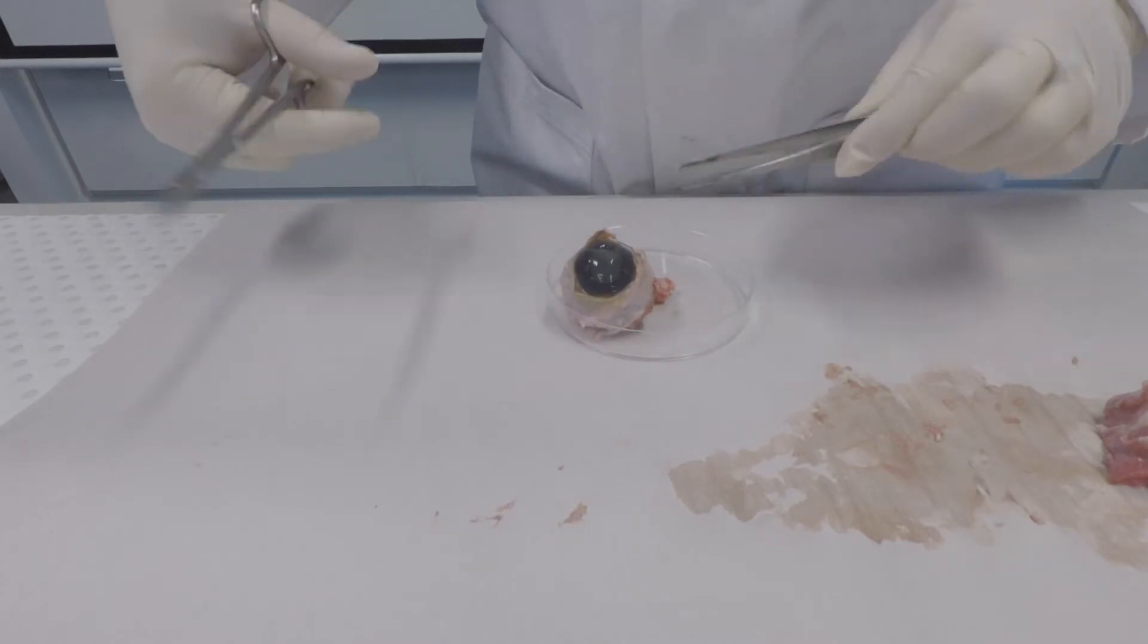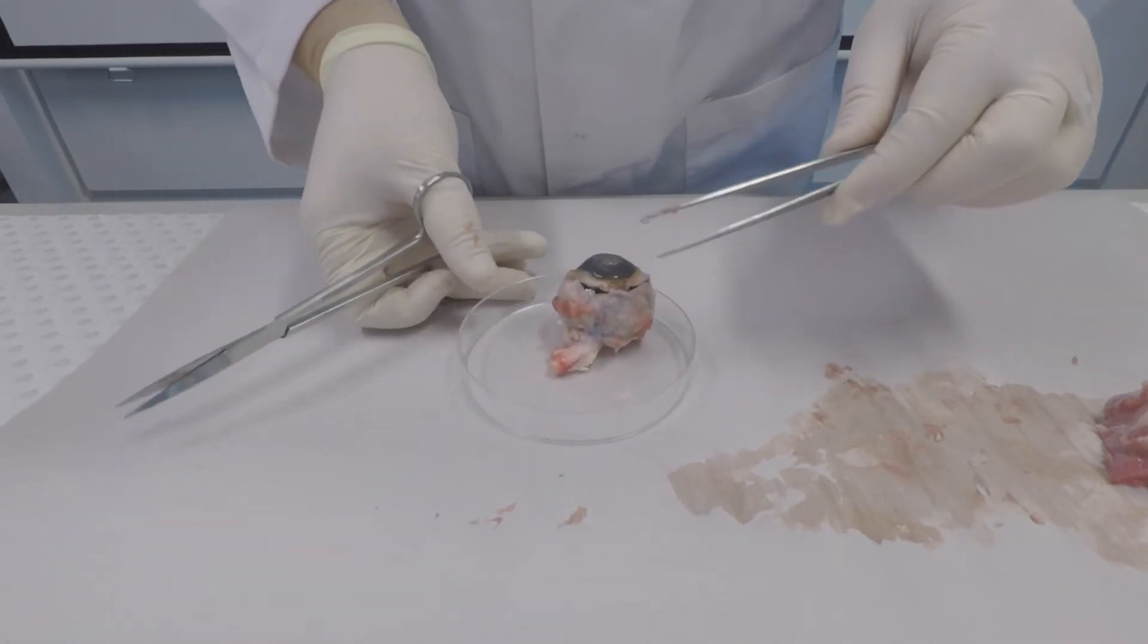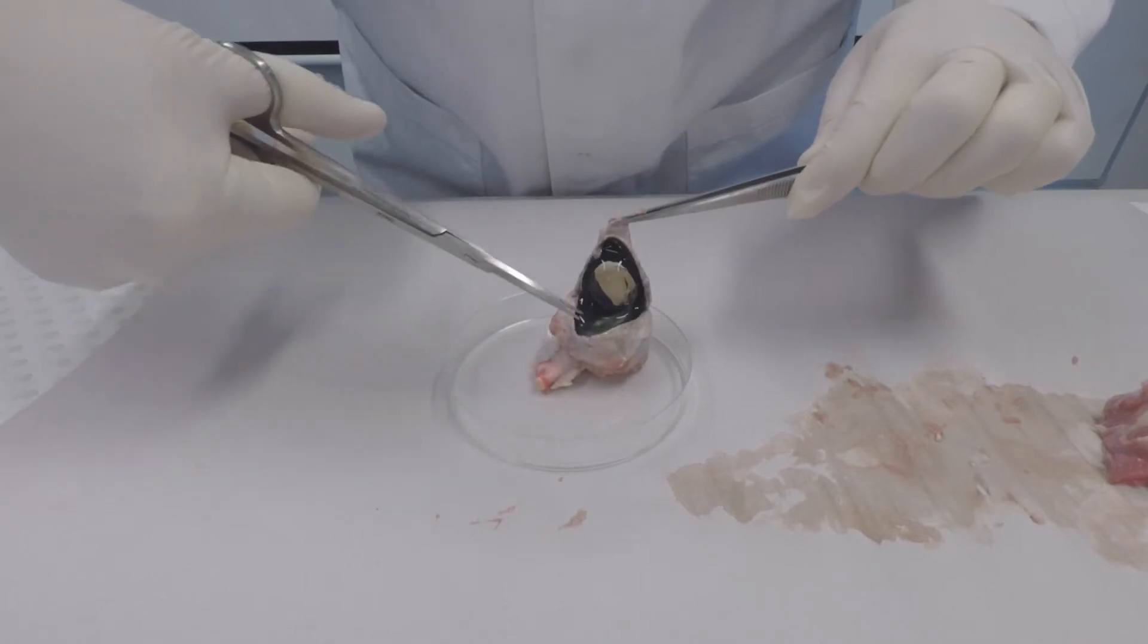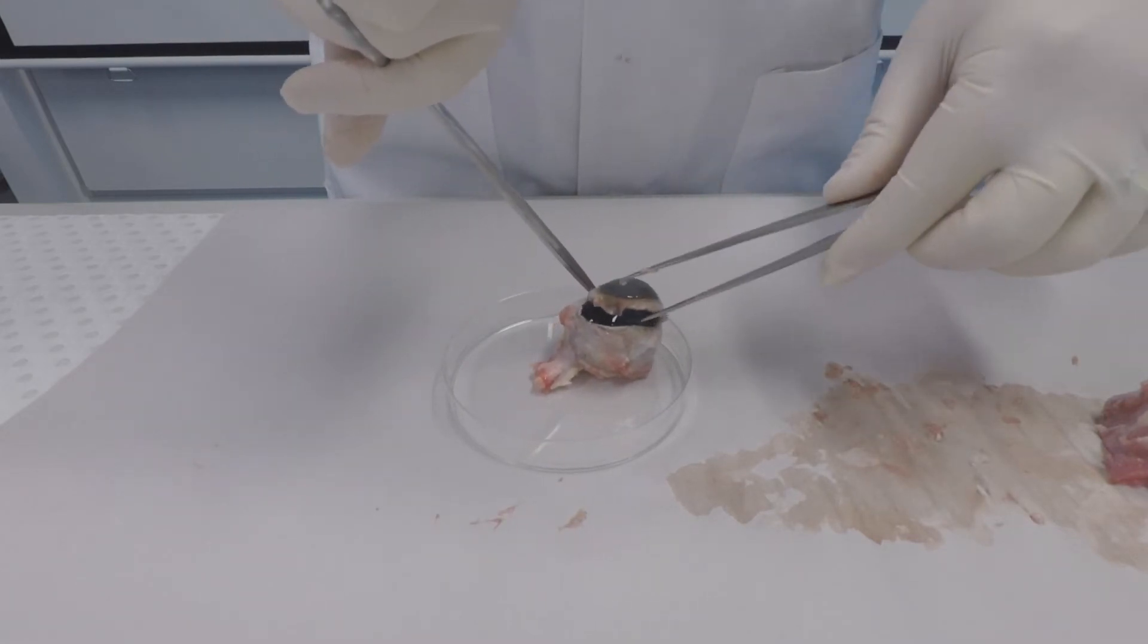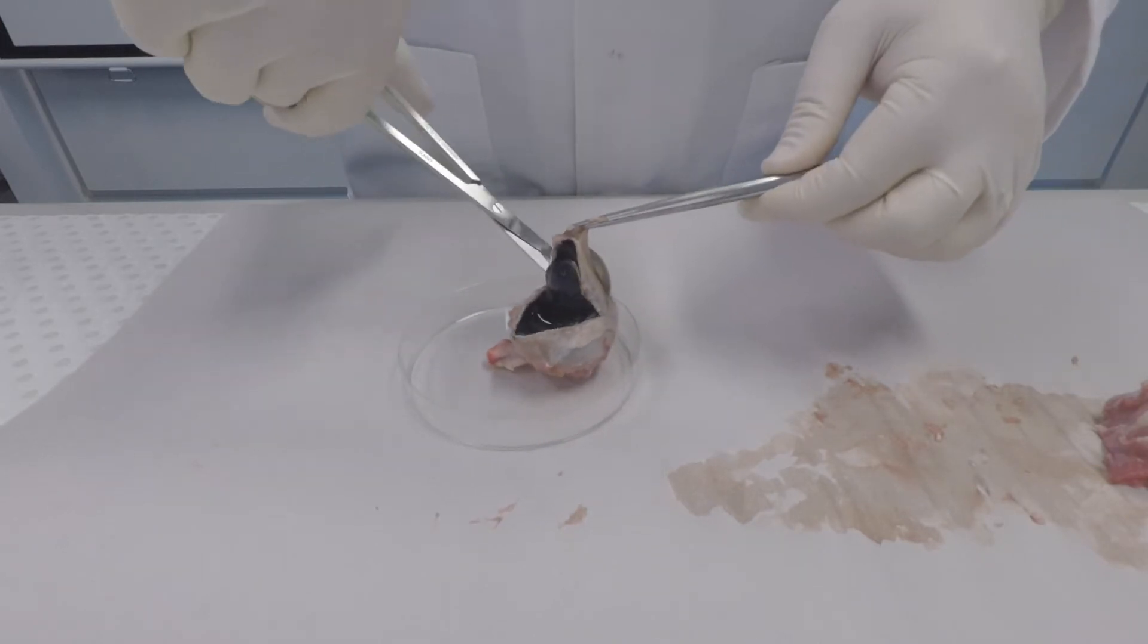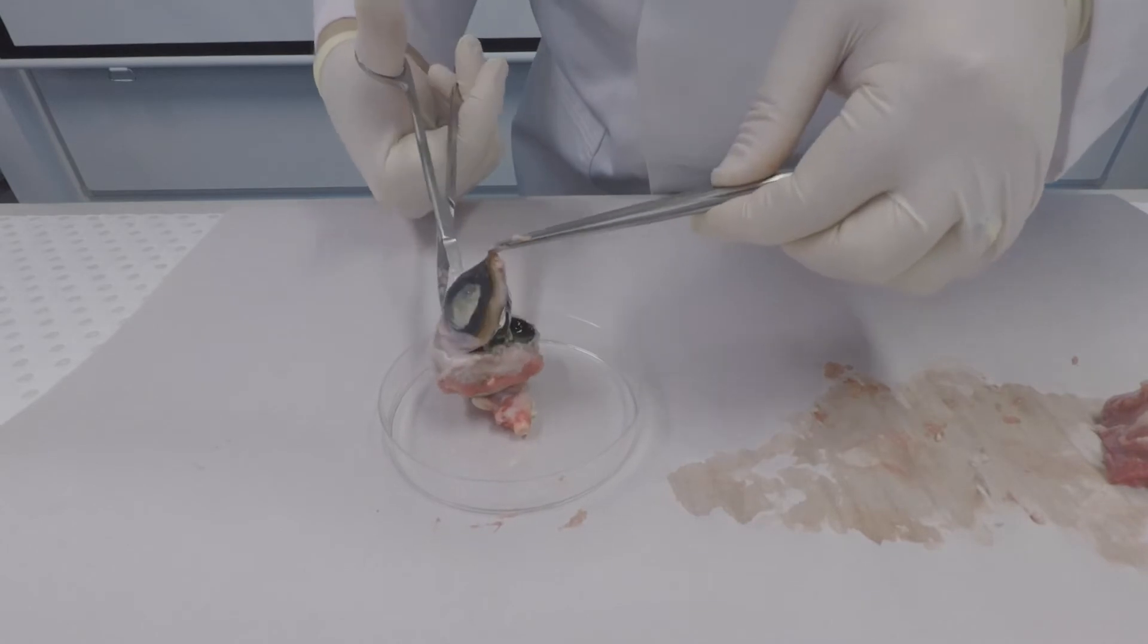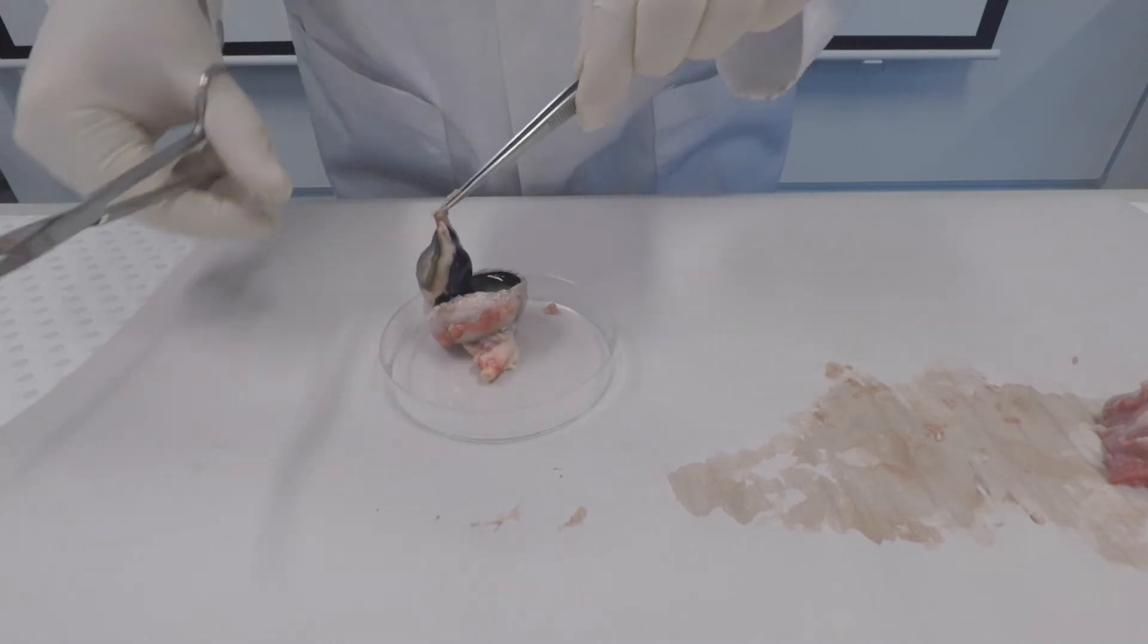Around the edge of the cornea underneath you can see a dark circular pattern—that's the ciliary body. Inside the eyeball you can see a clear fluid. It's quite viscous and thick. This is the vitreous body or vitreous humor, and that takes up most of the space inside the eyeball. In between the cornea and the vitreous humor is a clear, round or oval structure called the lens.